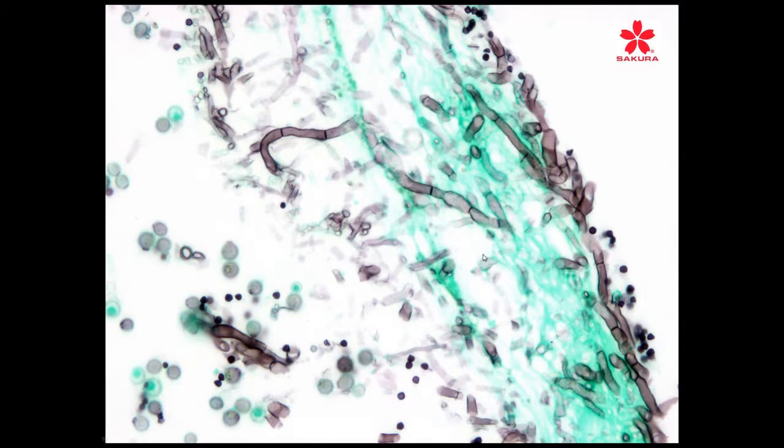because it doesn't take long before some of these organisms are overstained, and they pick up so much silver that you cannot see the hyphae in between these. And therefore it makes it difficult to distinctly identify the morphology and identify specifically what type of organism this is. It's very easy to misdiagnose these organisms.